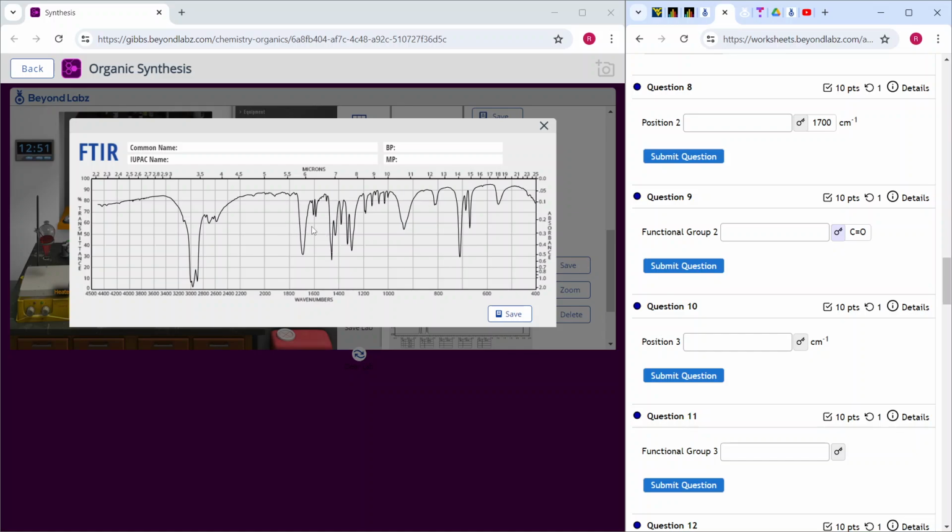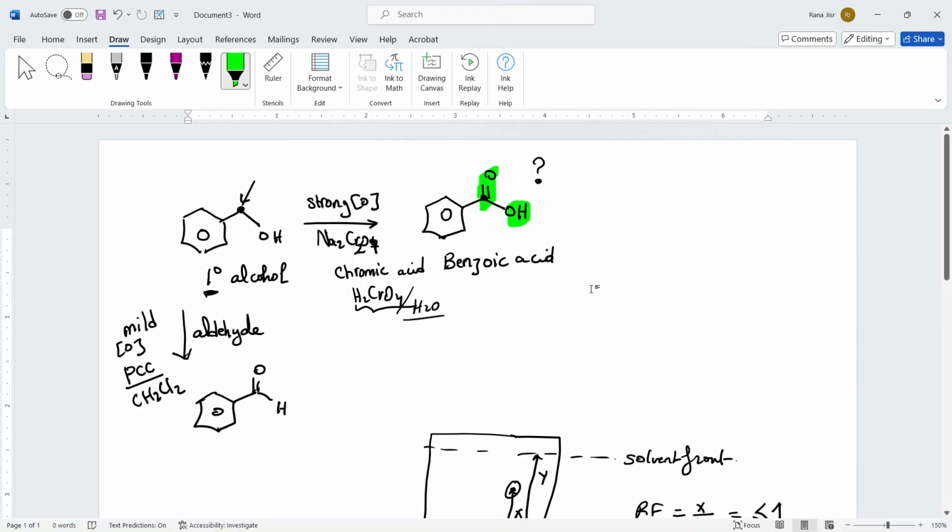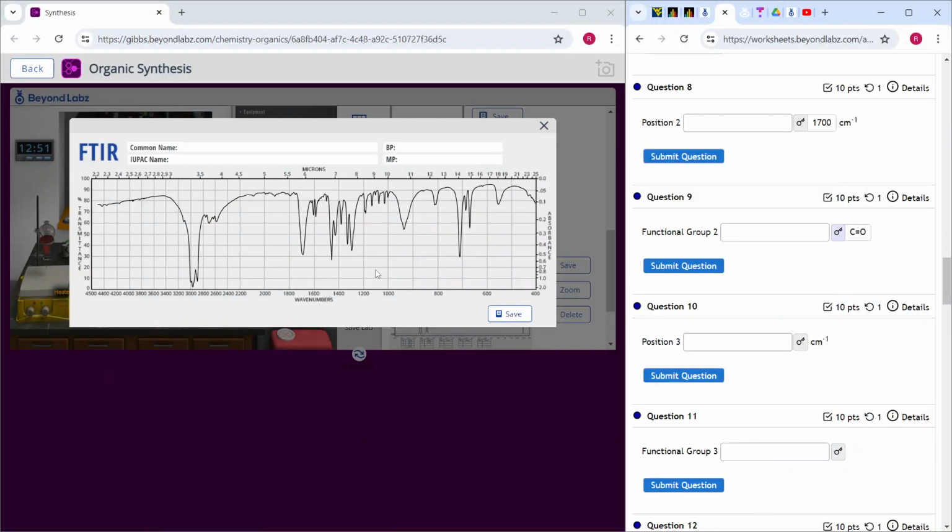Okay. With position number 3, if you look at the acid, because I am focusing on the acid, they are focusing on the stretches of the acid. So on the stretches of the acid, I have the sp2 CO. This is the peak number 3 in there. Notice that there is nothing for the benzene. Why is there nothing for the benzene? Because I know that benzene is at 1600, but it's very, very small in there. So this is why you don't even mention the benzene, but there is a sign that you have a benzene, by the way, which is this peak over here.